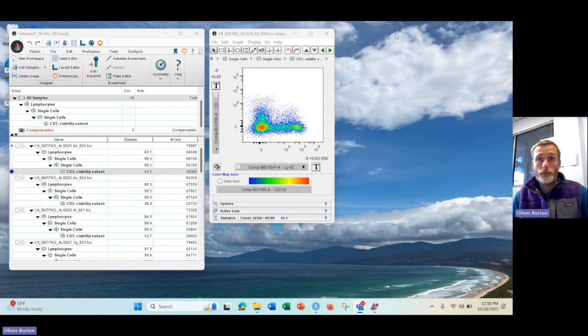Now, if you're an expert and you want to transform your data in a specific way, well, we support that. In this section, we'll go over how to do that in FlowJo and how to export your data with that transformation applied for use in the flow-cytoscript. For this, I'm using some data from a mixed bone marrow chimera generated in mice. I've gated on viable T cells here, and we're going to look at how to set the transformation for a few parameters.